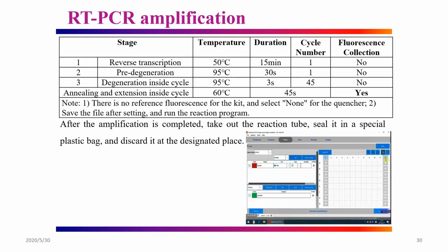After selecting the sample well position, we need to tick the target name and add the target name to the well position. We can modify the target name here. For example, African swine fever virus can be changed to ASFV. Click OK.